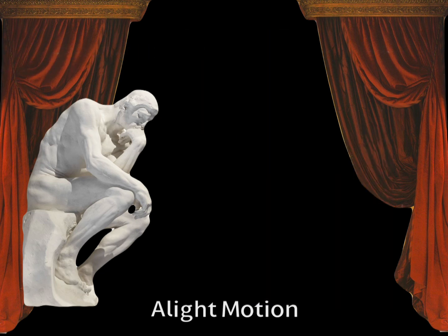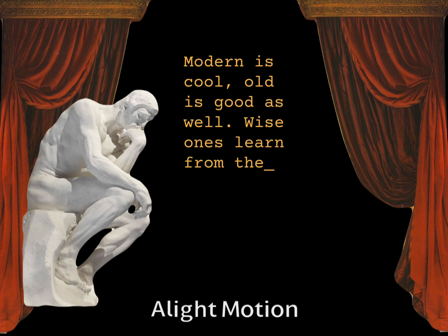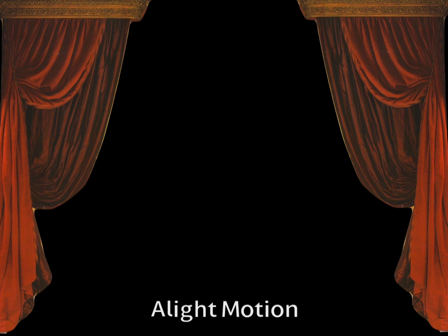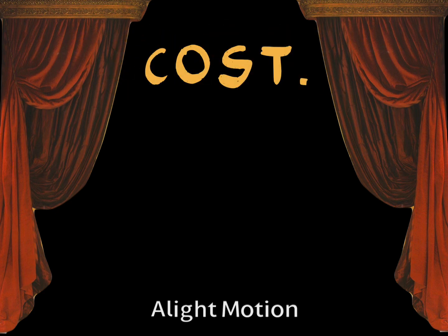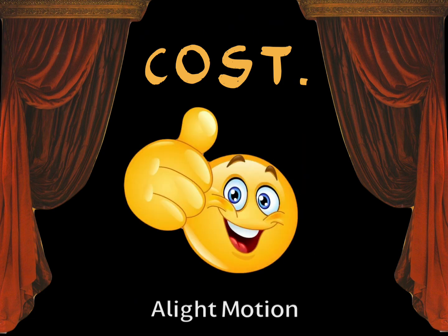Sanger sequencing, both modernized and original versions and iterations, is still used today for projects, especially those with fewer DNA samples because it can be faster for smaller sample sizes. Cost. Because of newer technology that has made it easier and faster to sequence DNA, the price has dropped drastically, going from millions of dollars to now as cheap as $600 to $1,500, depending on how in-depth and what kind of service is needed.